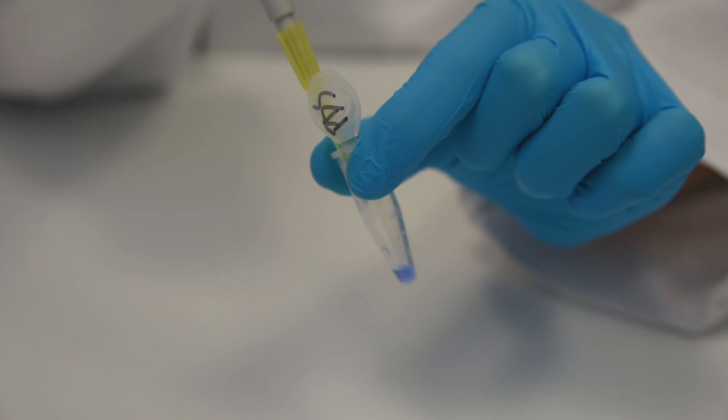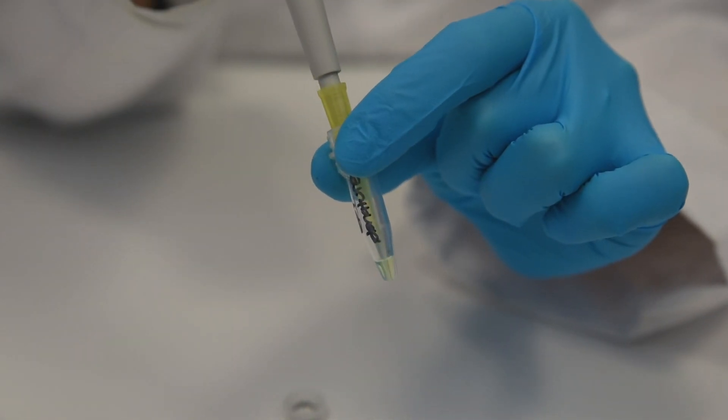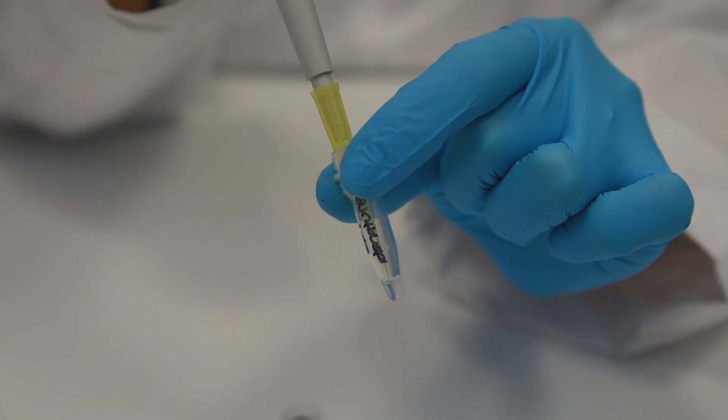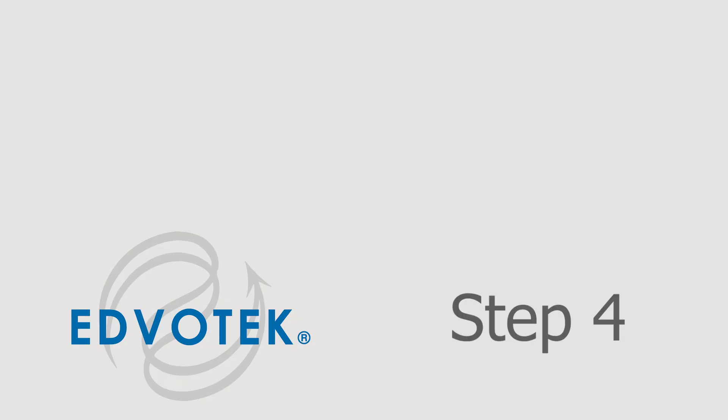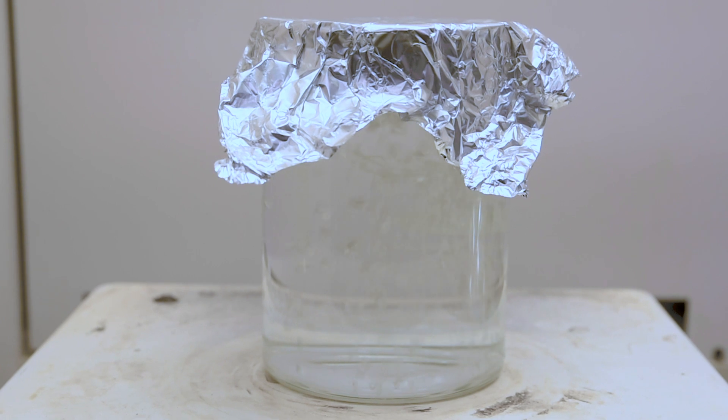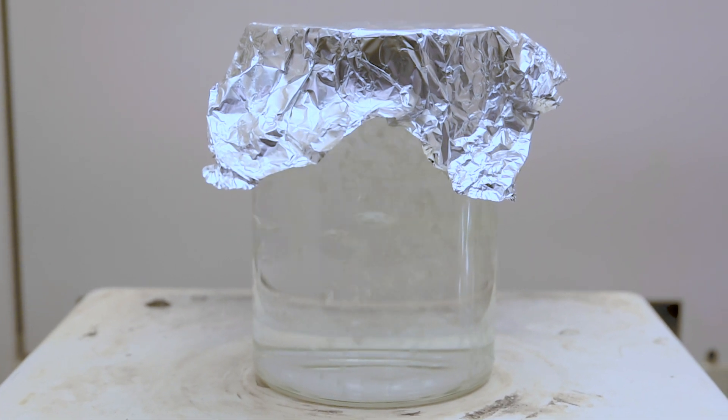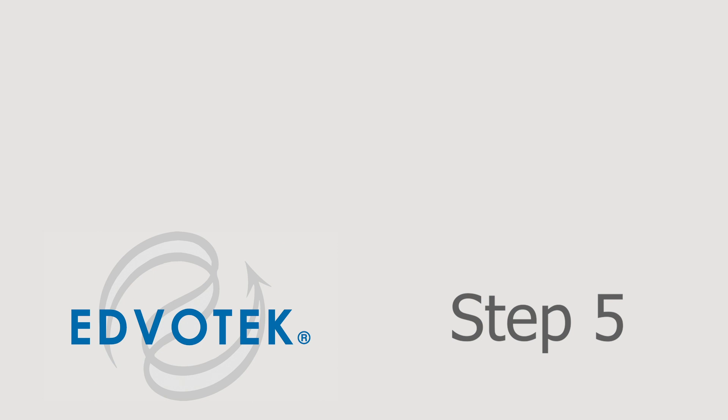Preparing denatured proteins or boiled. Step 3: To denature the protein sample, add 10 microliters of protein denaturing solution to the tube labeled GFP denatured and mix well. Step 4: Bring a beaker of water covered with aluminum foil to a boil on a hot plate.